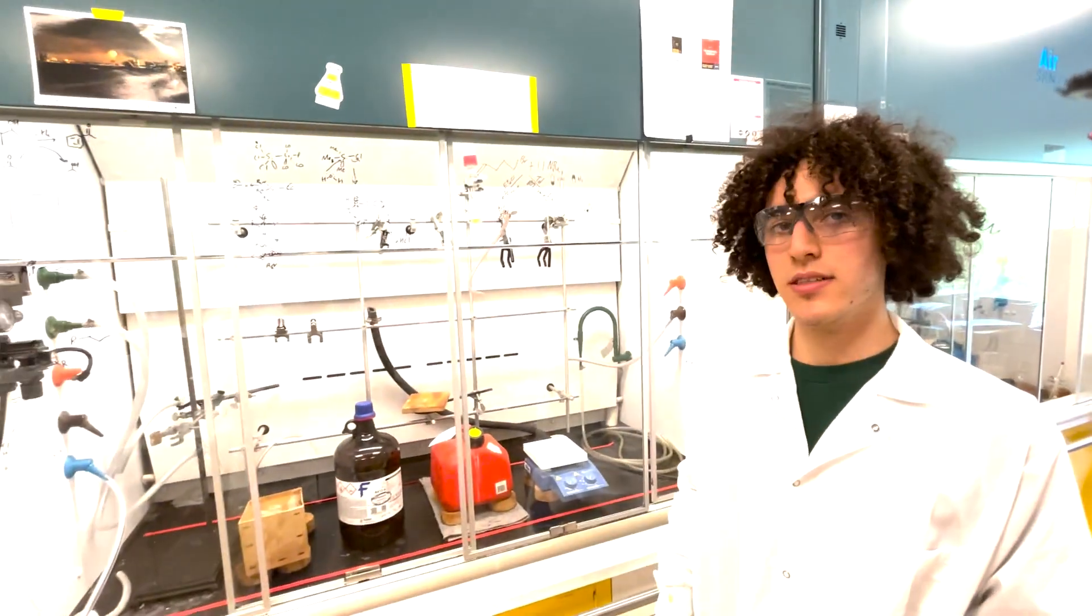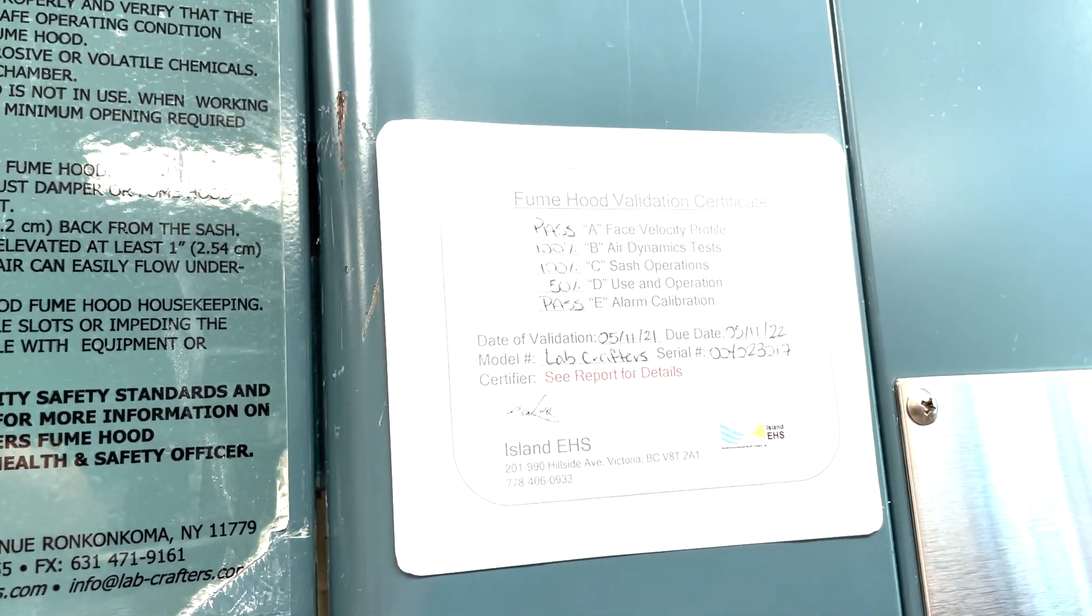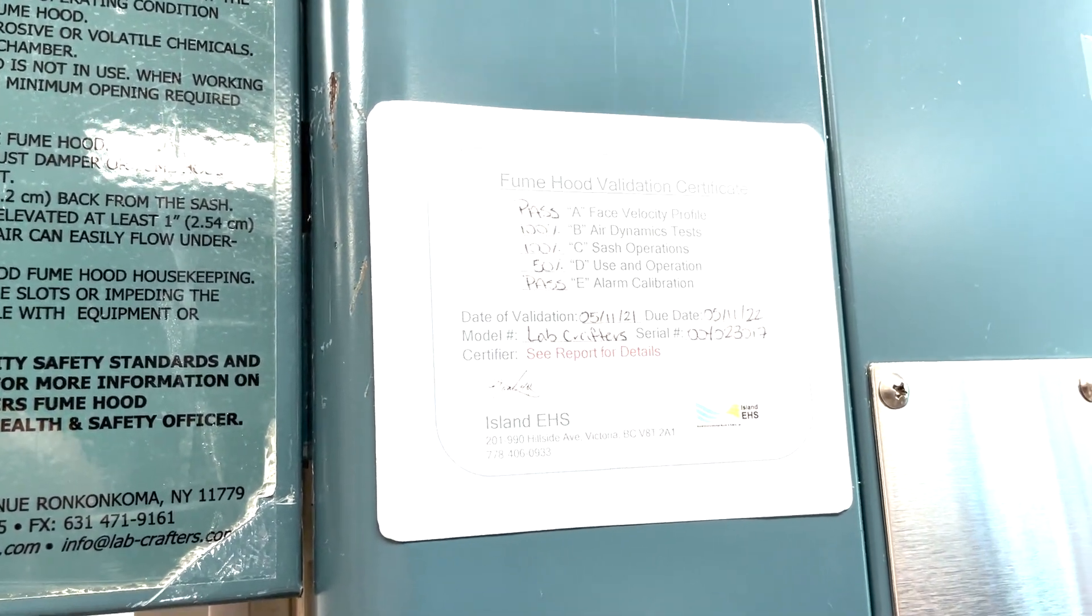Fume hoods here at UVic are tested annually for their effectiveness and that is shown by this certificate. On that certificate, you get a date of validation and a date for the next inspection.